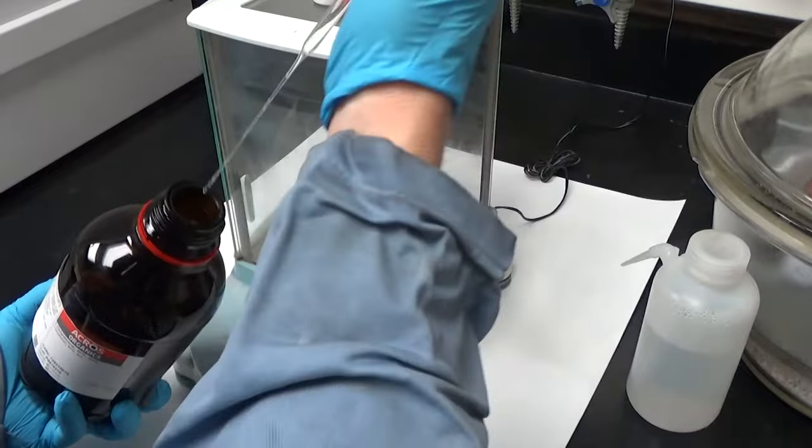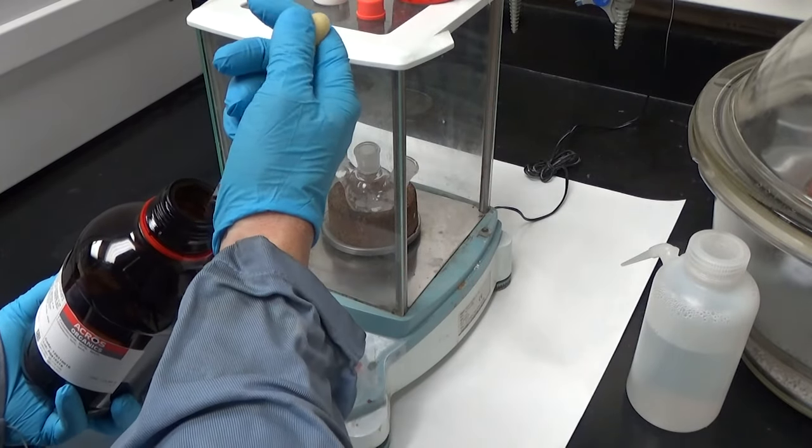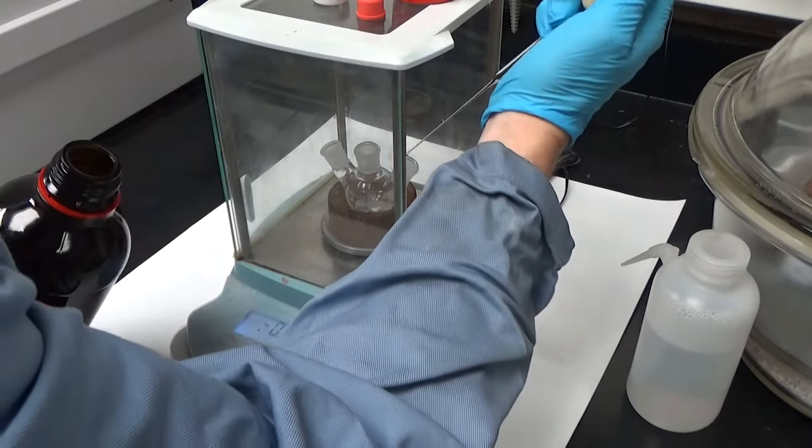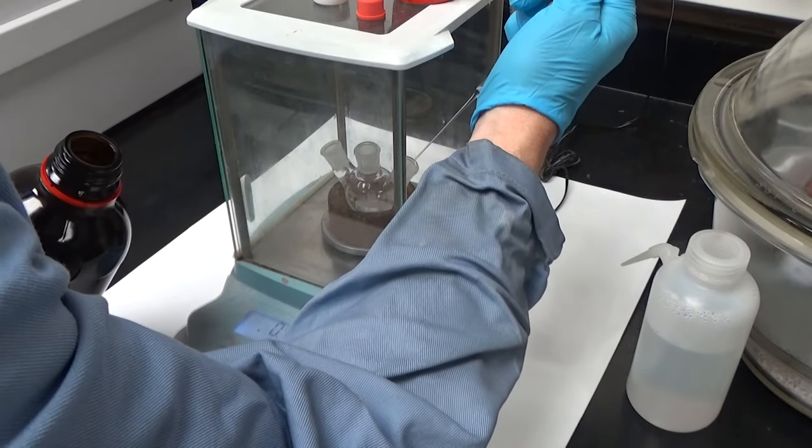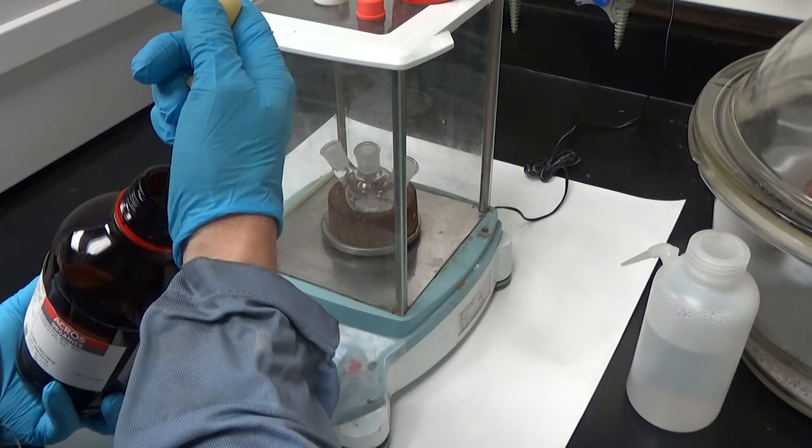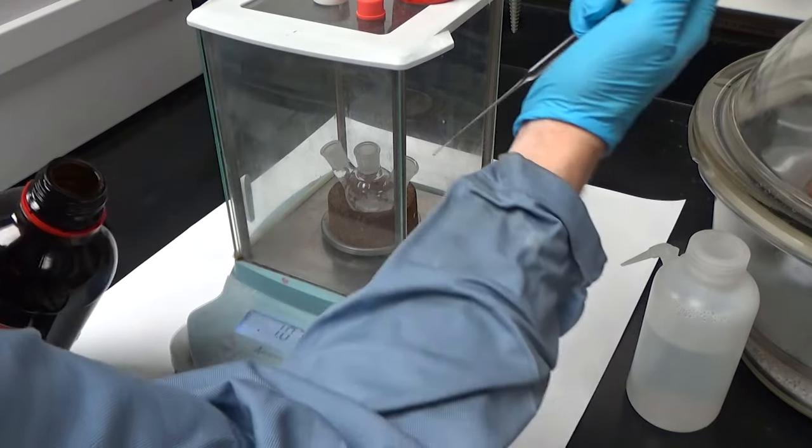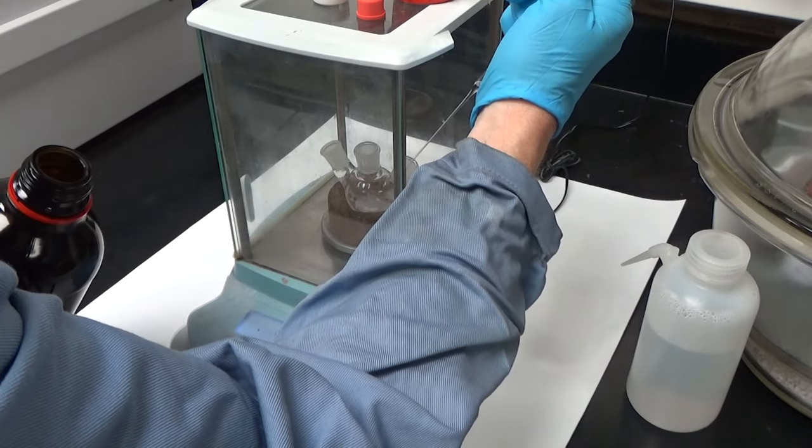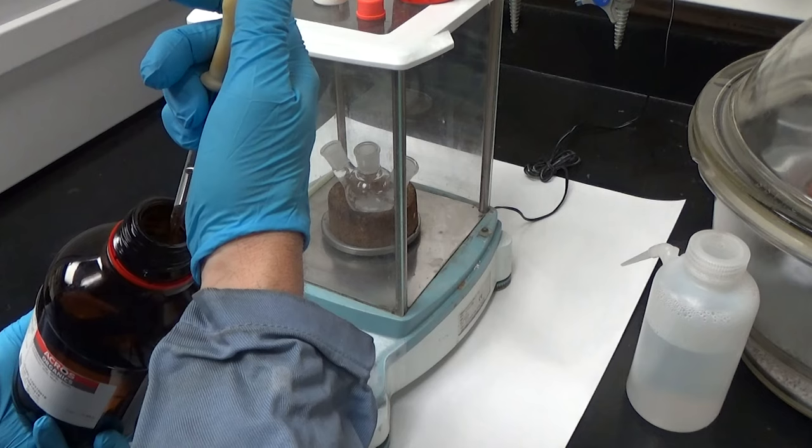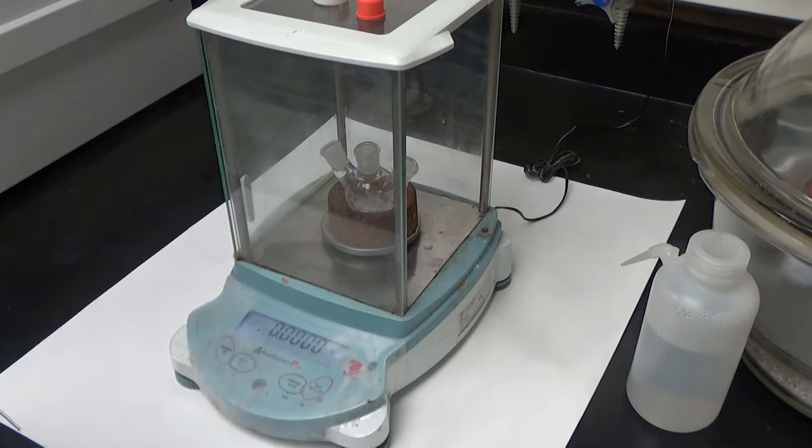So now we're weighing out the solvent and you notice I'm not using a graduated cylinder or syringe and that's because a balance, this is an old balance that can take a little at the higher end of the weight scale. I like to weigh solvents out because it's actually way more accurate as long as you know the density. A balance has many more significant figures than a graduated cylinder.